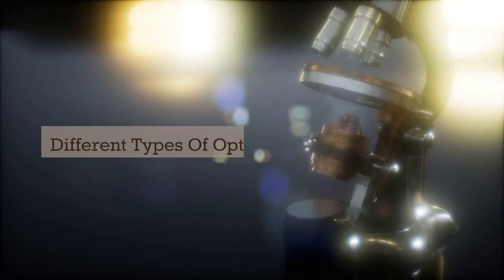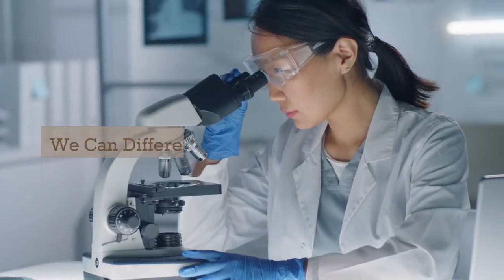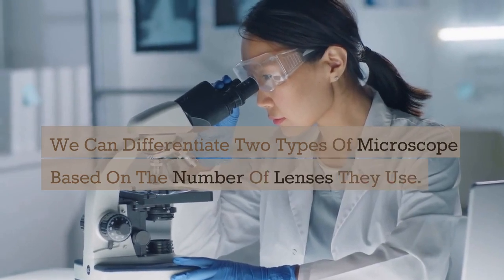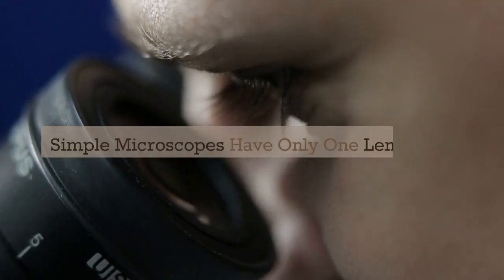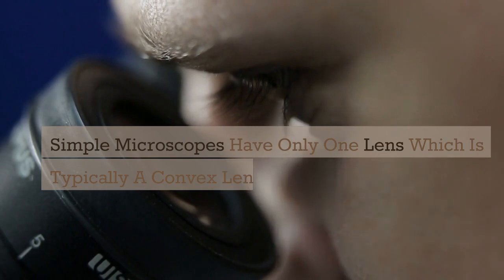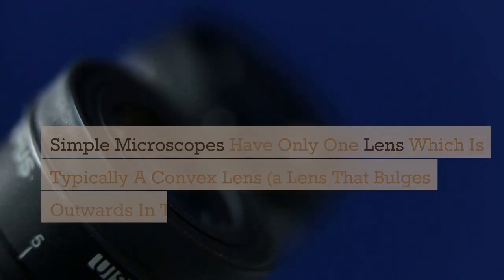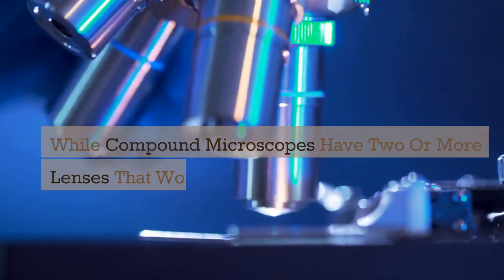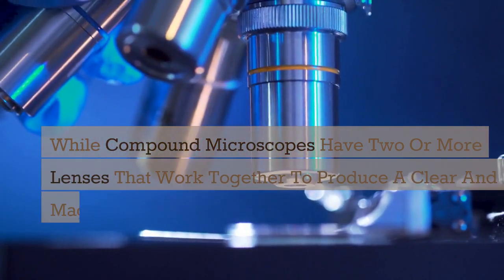Different types of optical microscope. We can differentiate two types of microscope based on the number of lenses they use. Simple microscopes have only one lens, which is typically a convex lens, a lens that bulges outwards in the middle, while compound microscopes have two or more lenses that work together to produce a clear and magnified image of the object being viewed.